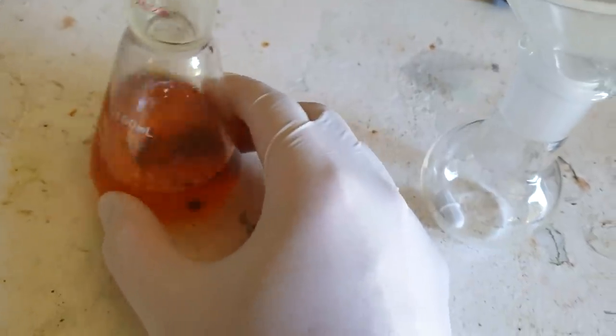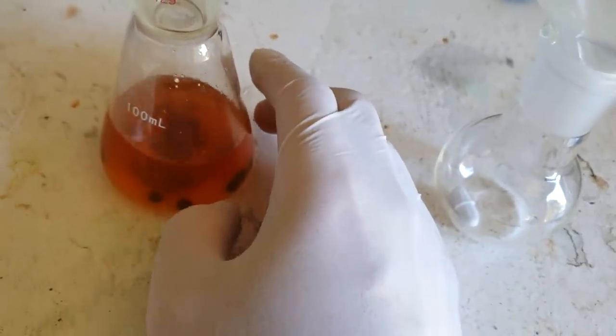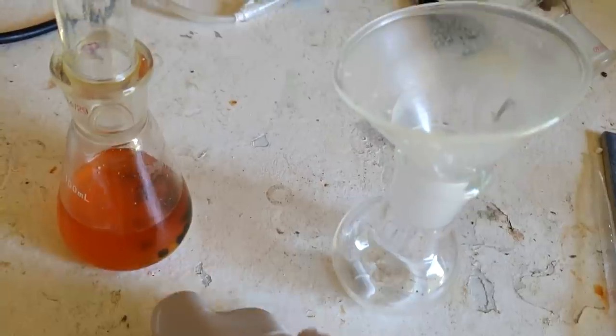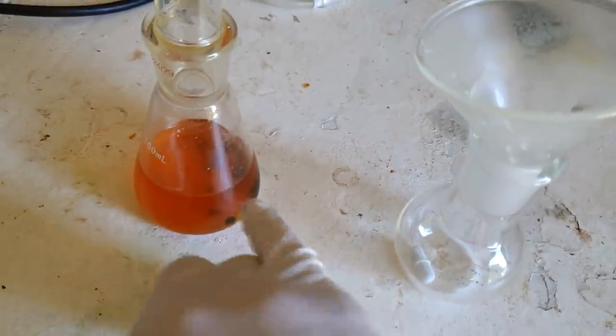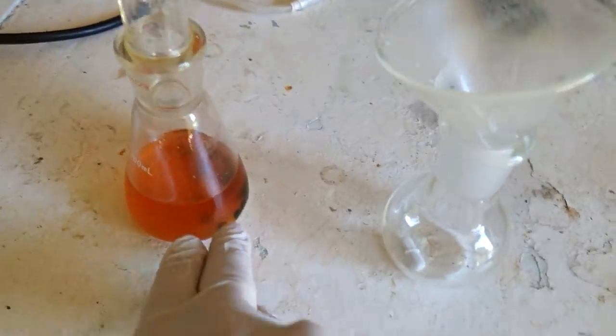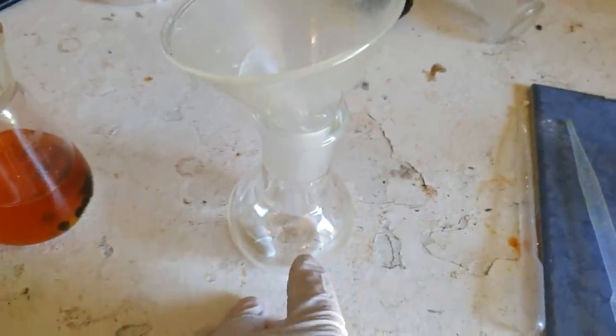It's currently over some anhydrous sodium carbonate and just a few molecular sieves. I'm trying to remove the water from this. I'm not doing a great job of it, but I'm going to filter it into this flask, and we're going to be removing the solvent. So the paper we're following does this under vacuum. They obviously just rotovap it, which is a cool bit of equipment that I don't have. So I'm just going to be doing, you know, unrotary evaporation.